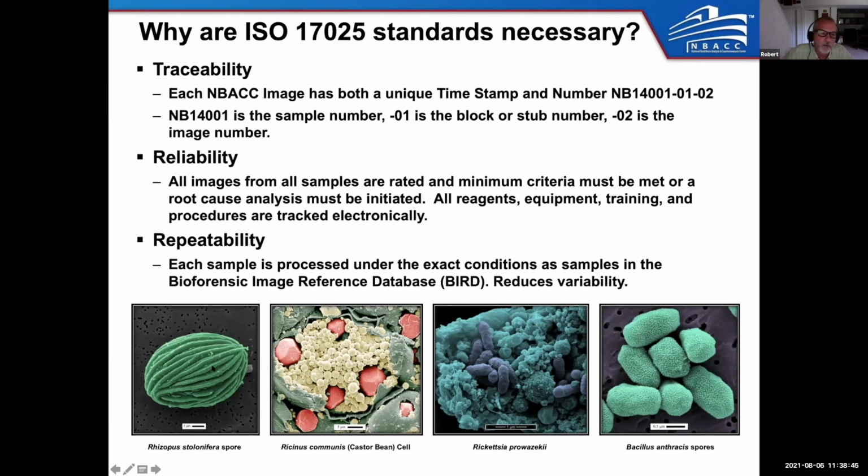So here, these are not all hazardous organisms, but on the bottom left, you have a Rhizopus stolonifer spore, and you may say, well, what does this spore have to do with anything in forensics? Well, we look at lots of different kinds of pollen samples because forensic samples, the clothing you have on right now has pollen on it from where you live. And if you go online, you can follow the allergy database to figure out which pollen samples are high, in which parts of the month, and which times of the year. And if you vacuum your clothing, we can find the pollen to figure out, in general, the region you have been in or are from.